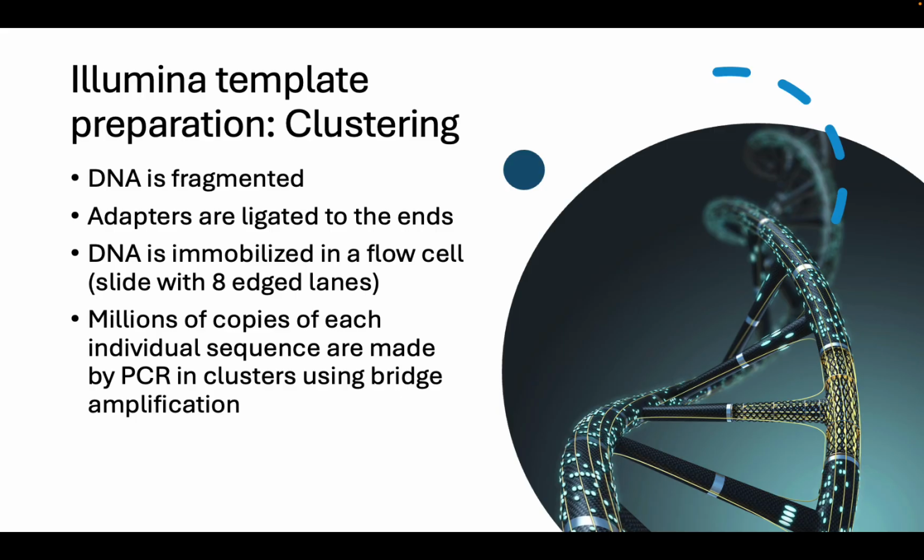And what I'm going to have you look at next is a video put out by Illumina on how this technology works.